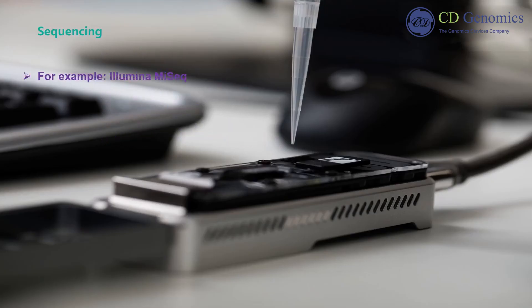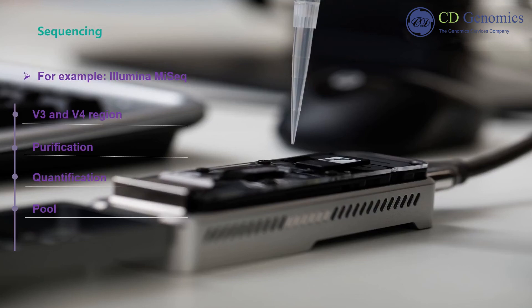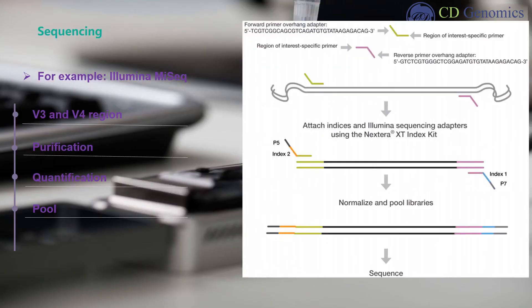When sequencing is performed with Illumina MiSeq, V3 and V4 region is commonly amplified by using a limited-cycle PCR. The PCR products are purified, quantified, and pooled. Subsequently, add Illumina sequencing adapters and dual-index barcodes to the amplicon target. By using the full complement of Nextera XT indices, up to 96 libraries can be pooled together for sequencing.